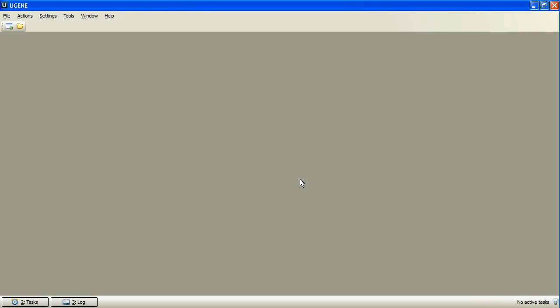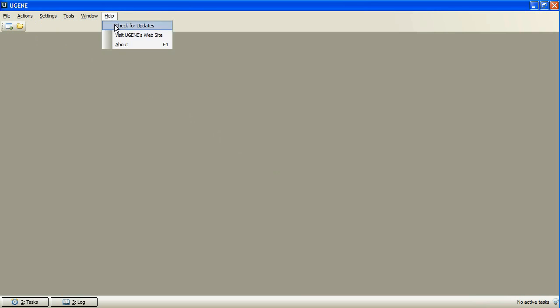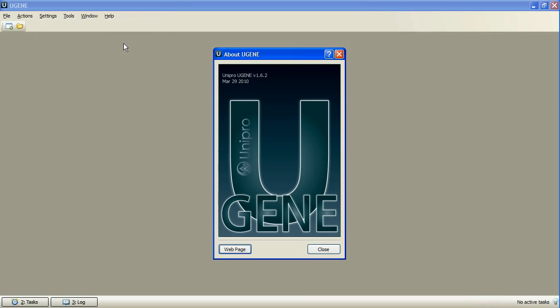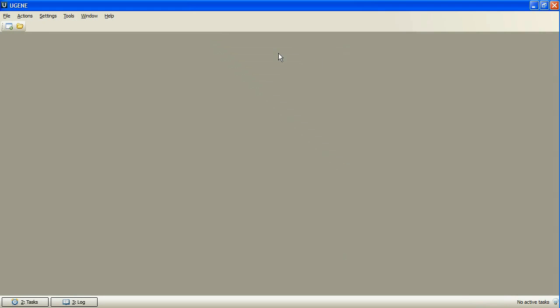First of all, we are glad to present you the UGENE Circular Sequence View. The view was requested by our users many times, so we have implemented it in UGENE version 1.6.2. To invoke the view, we will open a sequence.